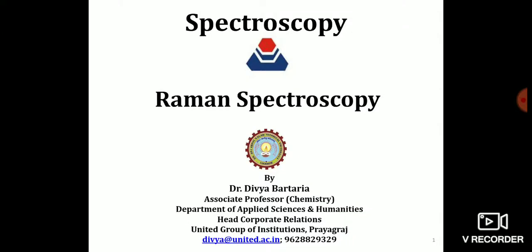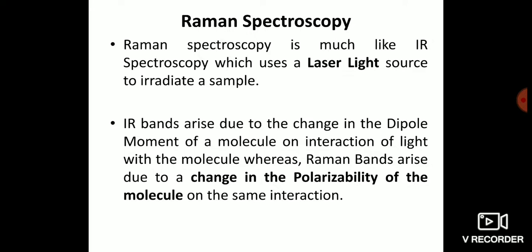Welcome dear students. Today we are going to discuss Raman spectroscopy. In Raman spectroscopy, it is very much similar to IR spectroscopy, but in Raman spectroscopy we use a laser light source to irradiate a sample, right?